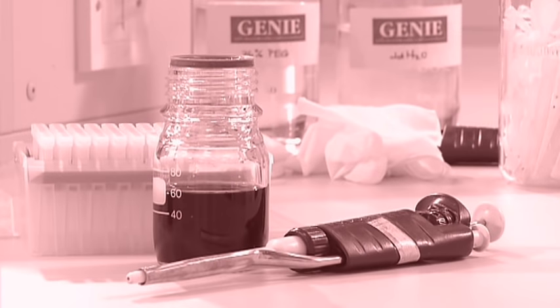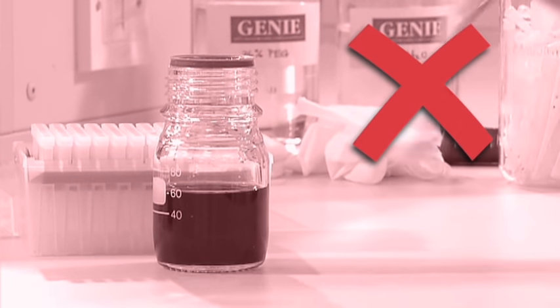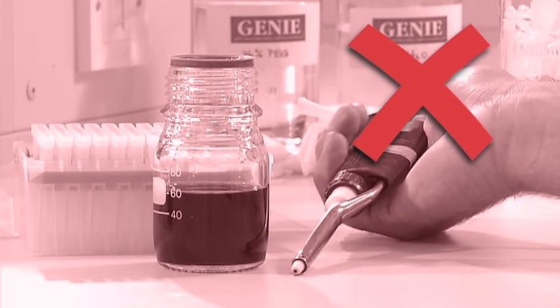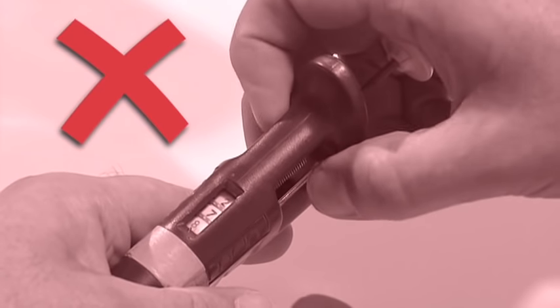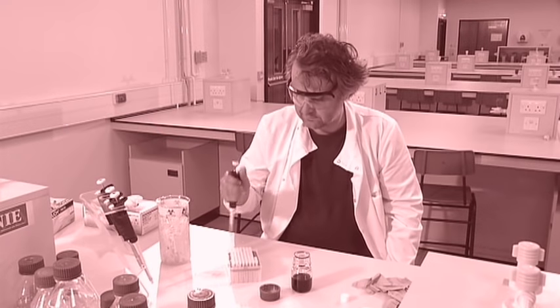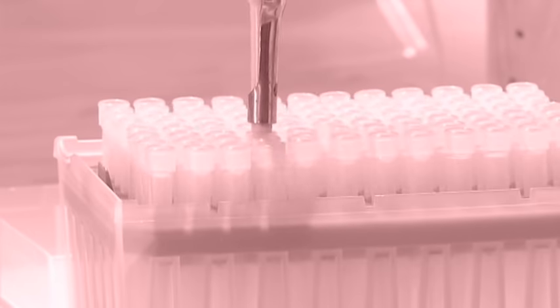Do not use a pipette without a tip attached. Liquid should never enter the body of the pipette — it will cause the pipette to corrode and will be a major source of contamination between liquids and experiments. Do not use a pipette past its volume limits, as this causes pipetting inaccuracies and damages the pipette. If you're having trouble attaching a tip, don't repeatedly jam the pipette into a tip, as this can damage the pipette.